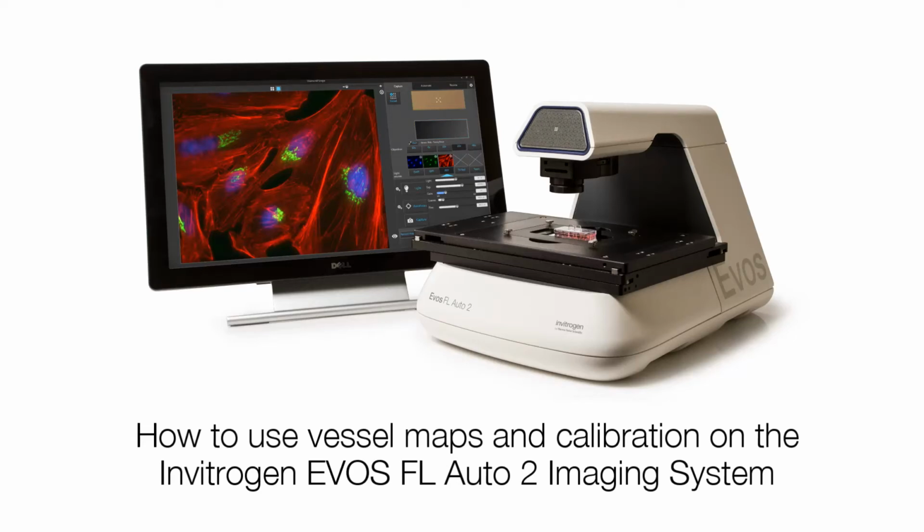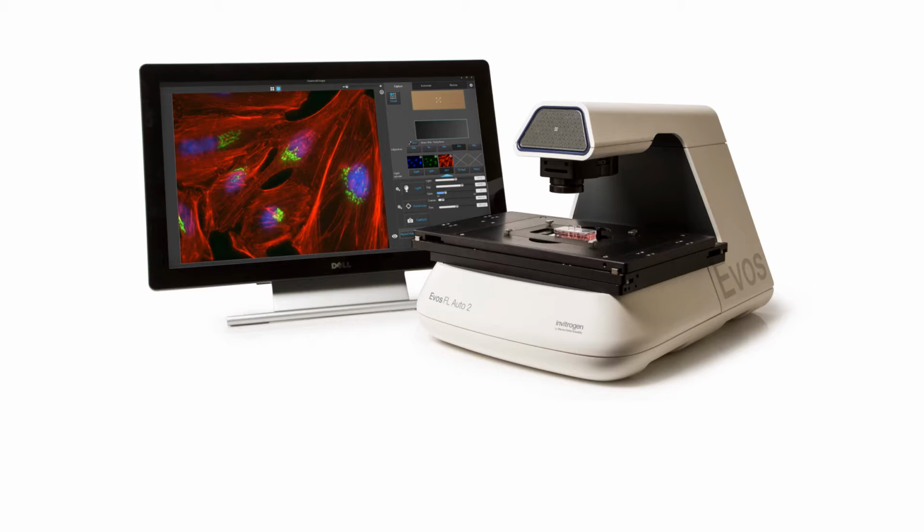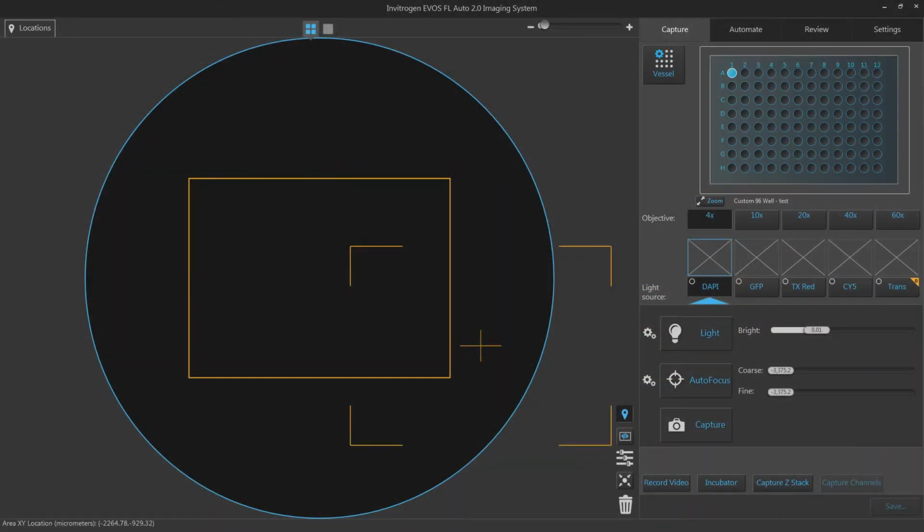In this video, you will learn how to import vessel maps and calibrate your existing vessel maps on the EVOS FL Auto 2 imaging system. Vessel maps allow you to define where you're imaging on your sample. These maps include well plates, slides, petri dishes, or flasks.